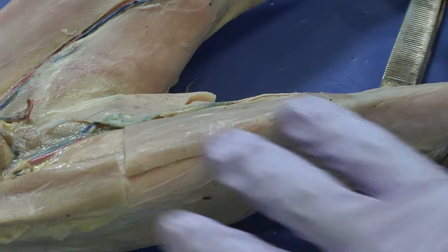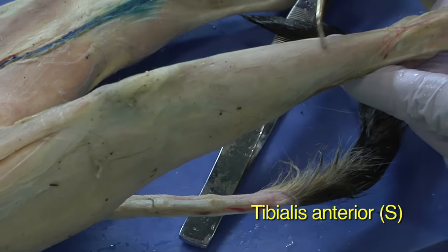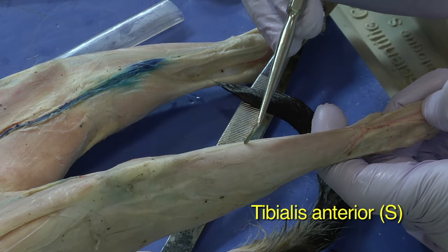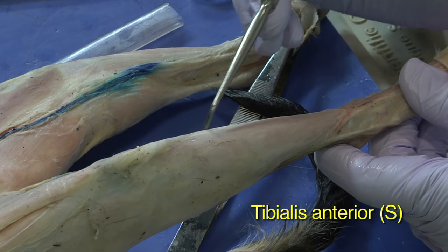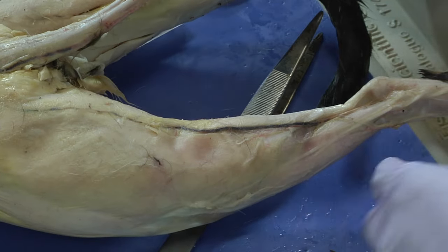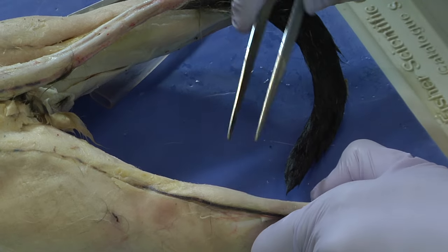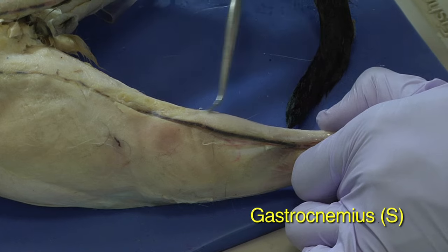The last muscles we'll look at are in the lower leg. The first is the tibialis anterior, which is already visible and doesn't need further revealing. Then, rotating the cat to the other side, the calf muscle — the gastrocnemius — is visible there.